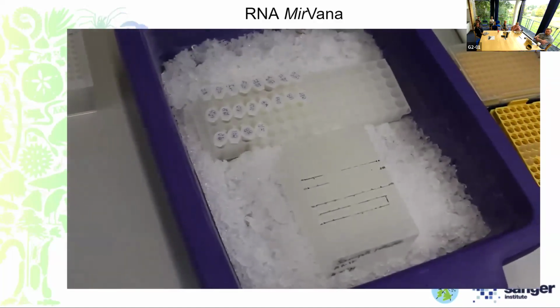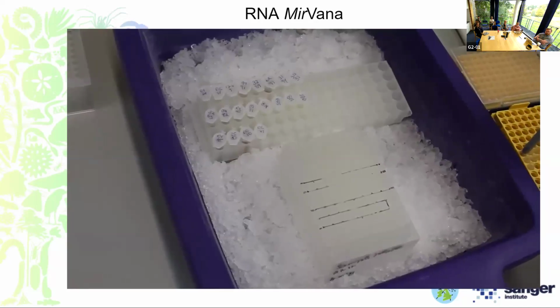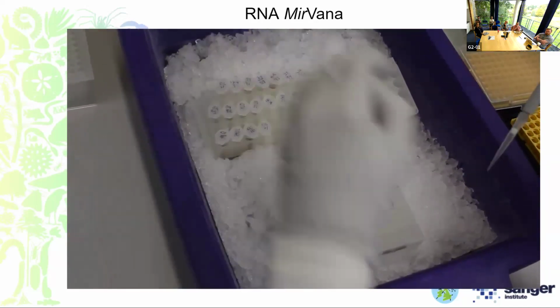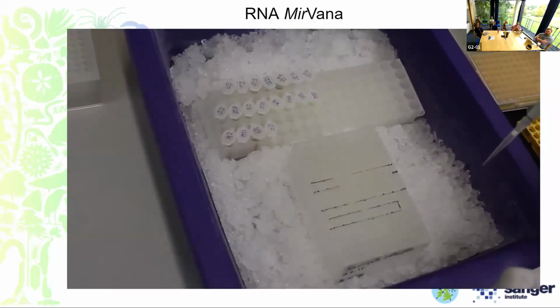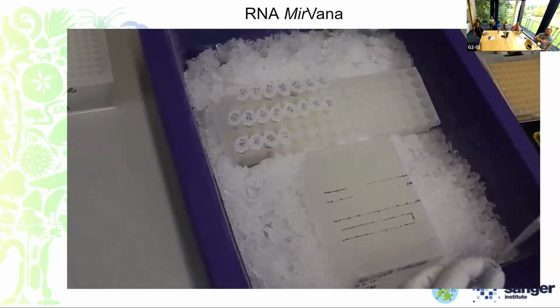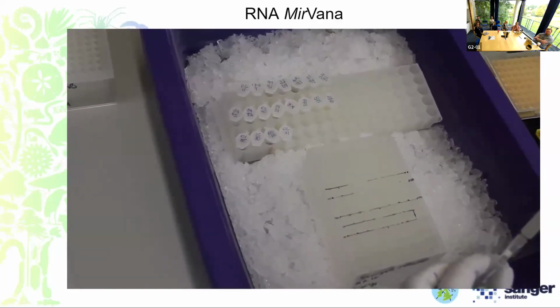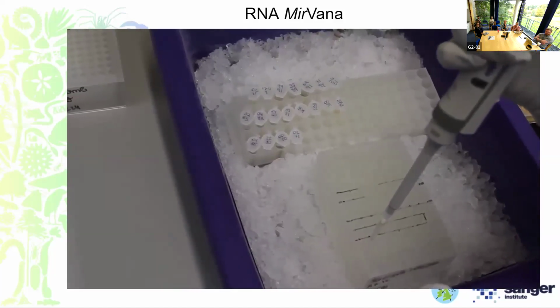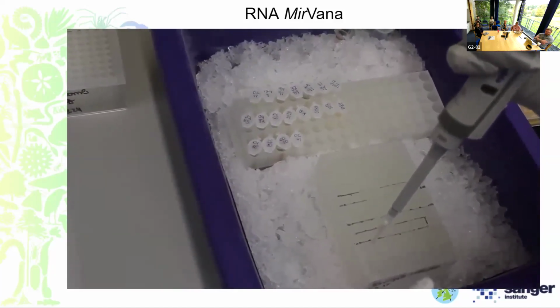And so once all the samples are prepped, we then tend to put them on ice just to keep them cool and prevent any RNA degradation. And then as we're going to have this process automated on the Kingfisher, we'll have a sample plate, and we'll take 200 microliters of each sample and put that into a well of the sample plate.